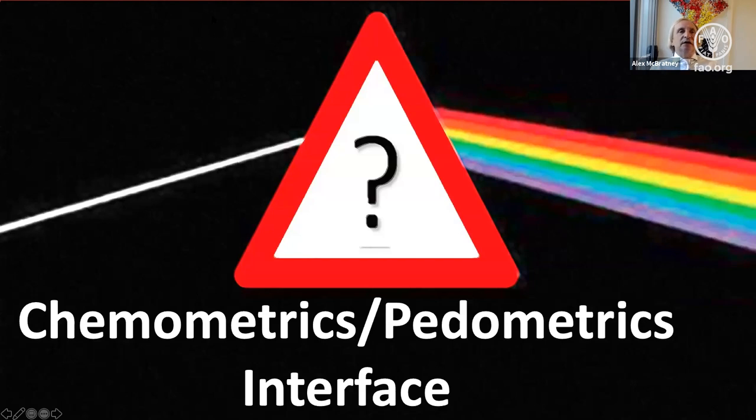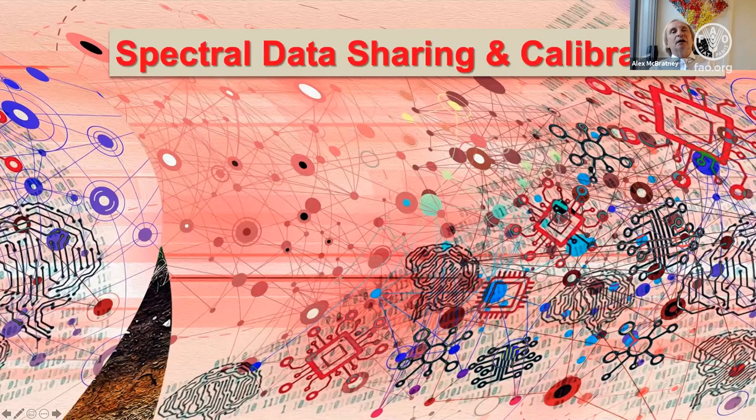Now, if we get on to the interface between chemometrics and pedometrics, between the soil statistics and the statistics of the spectroscopy, the whole question about spectral data sharing and calibration, which you're going to talk about in the future.